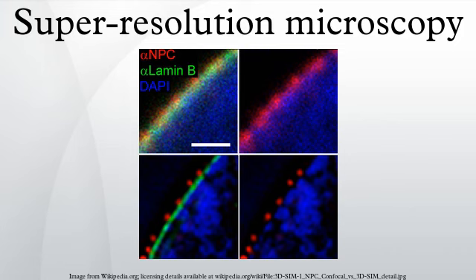Saturated structured illumination microscopy, SSIM, exploits the nonlinear dependence of the emission rate of fluorophores on the intensity of the excitation laser. By applying a sinusoidal illumination pattern with a peak intensity close to that needed in order to saturate the fluorophores in their fluorescent state, one retrieves Moiré fringes. The fringes contain high-order spatial information that may be extracted by computational techniques. Once the information is extracted, a super-resolution image is retrieved.